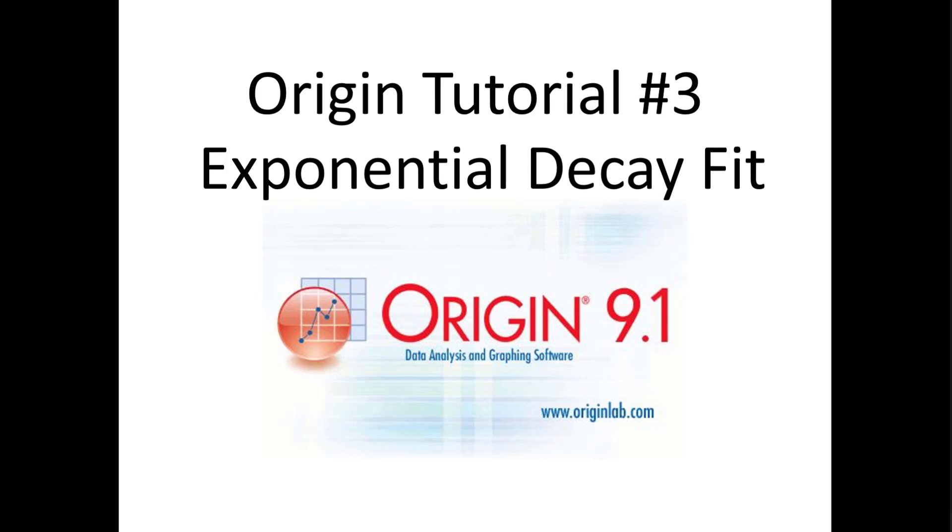Hello, welcome to the Origin tutorial number 3. In this tutorial we will be looking at how to fit data to exponential decay.